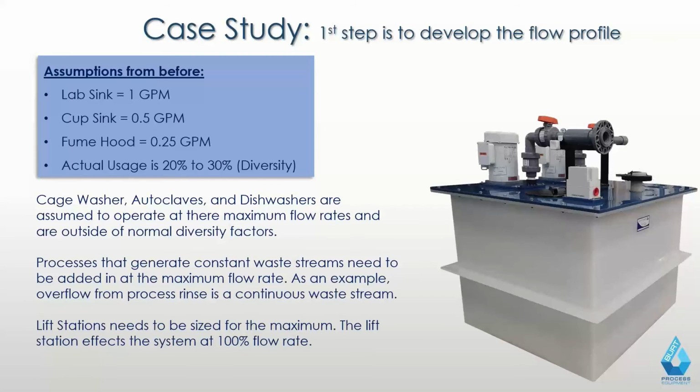This gets into a lot of issues as far as tank design and different types of tanks which are designed for acid and base when they're actually in the ground like that, buried. You can put a pH system in a vault. You basically have access to it, and that's done fairly commonly. You don't want to put reagent systems in vaults because now you have the additional issue of having to bring reagents down into a confined space, because everything down there is basically going to become confined space.